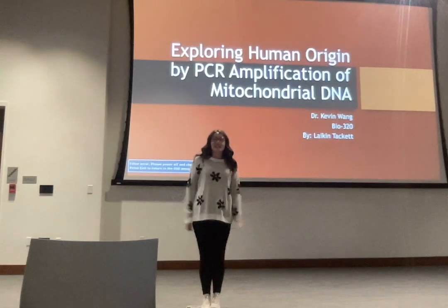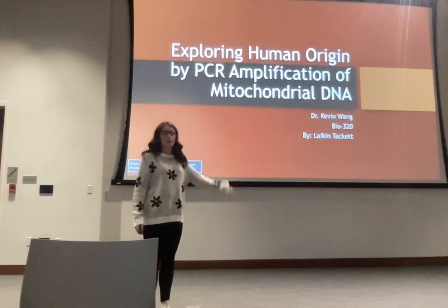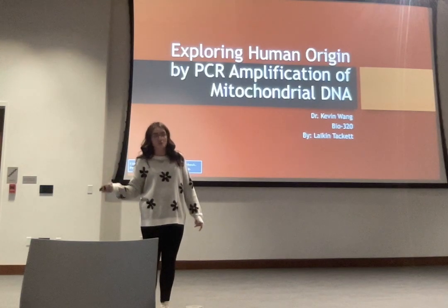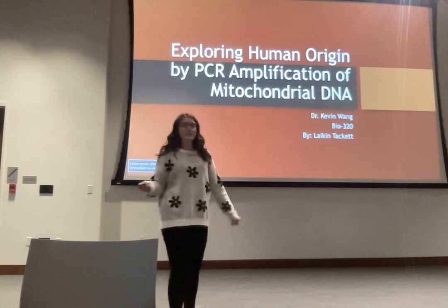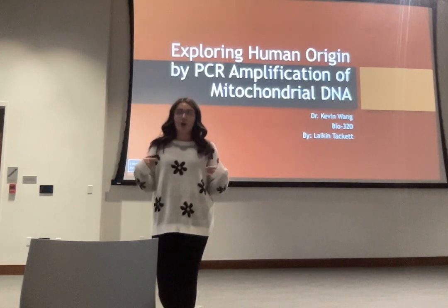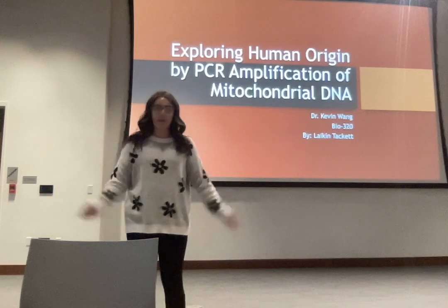Hello! In today's lab, we are going to be exploring the human origin made possible by PCR amplification of mitochondrial DNA. Before we do that, we must first understand just what mitochondria is and all the things that we can understand from it.